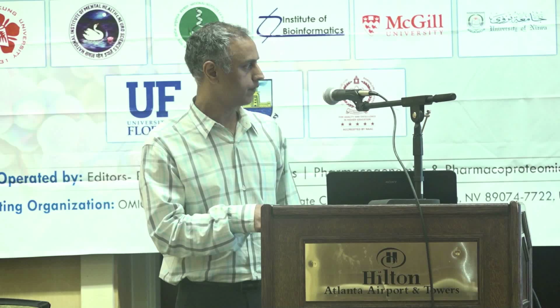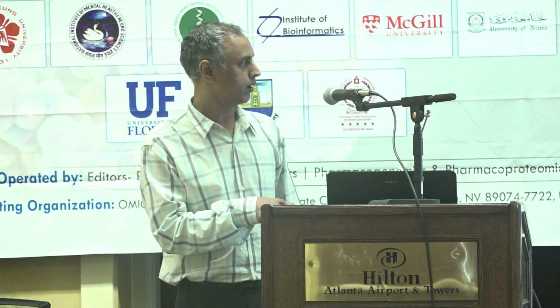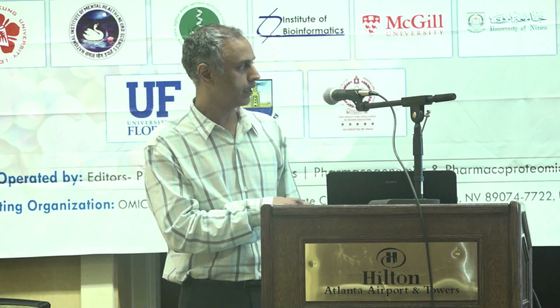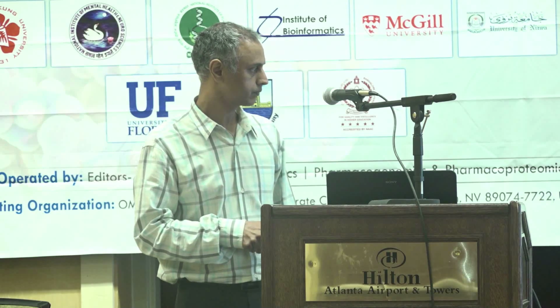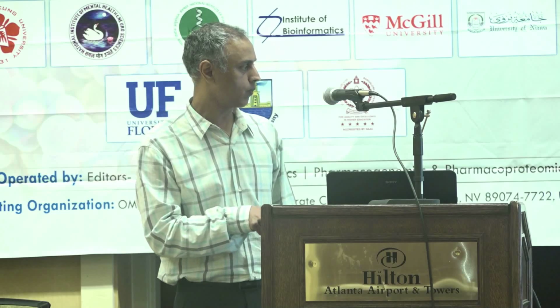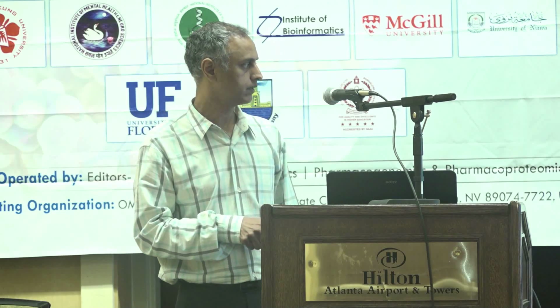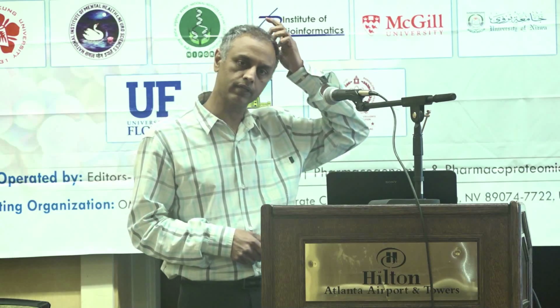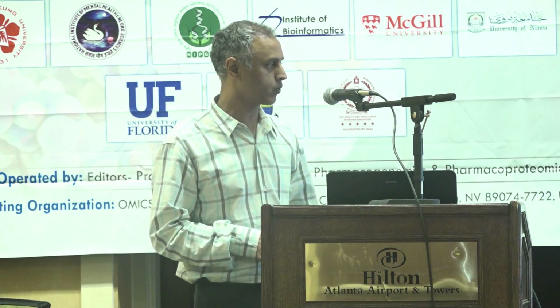Now, we have these examples where we found this KPC3 and one that they had mislabeled. These are OXA181. These are negatives. So in a targeted fashion now, we can pick up these resistance markers where we know the question we are asking.